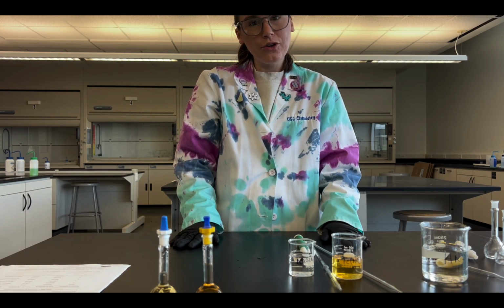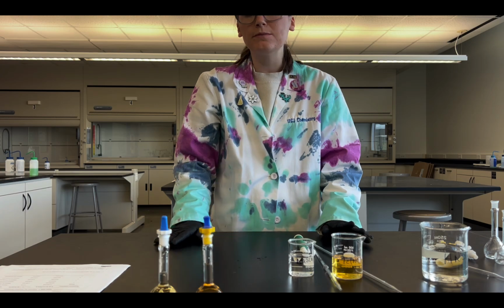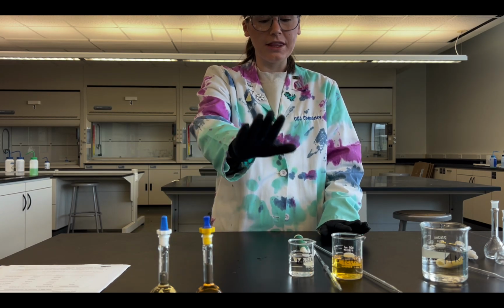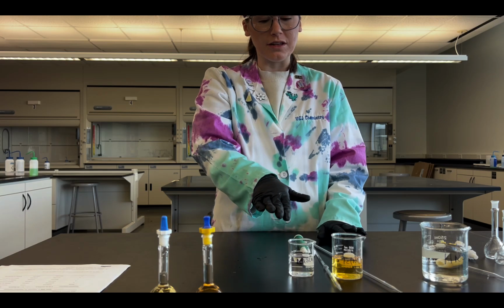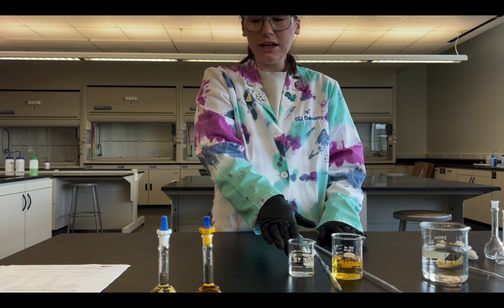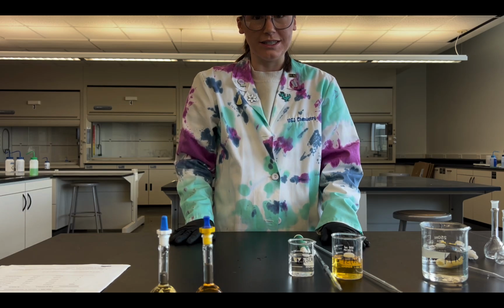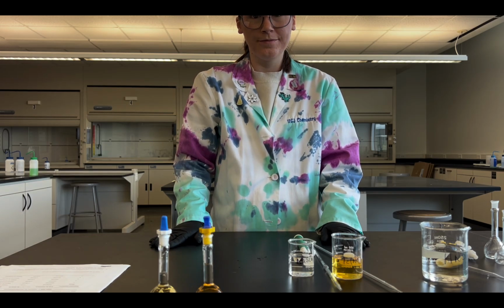Okay, so what I'm now going to do is I'm just gonna time lapse my next 4 test tubes. Again, it's the same process. The only thing I'm varying is my volume of the thiocyanate solution, just like my table tells me. So as you'll see, these solutions will start to get darker and darker.